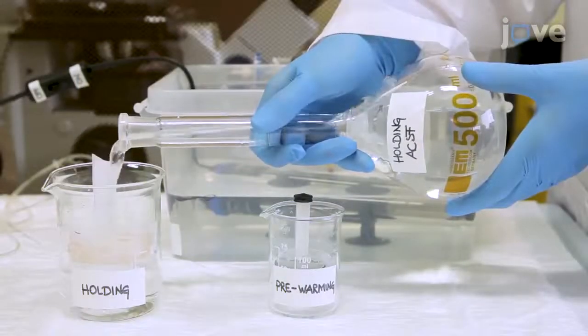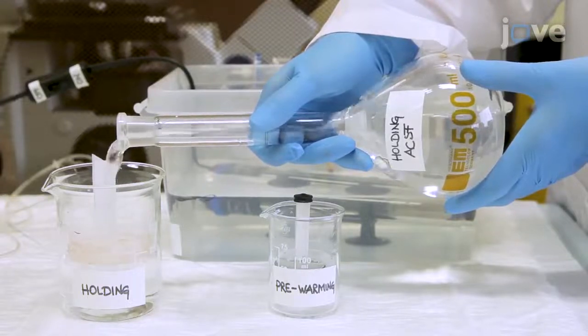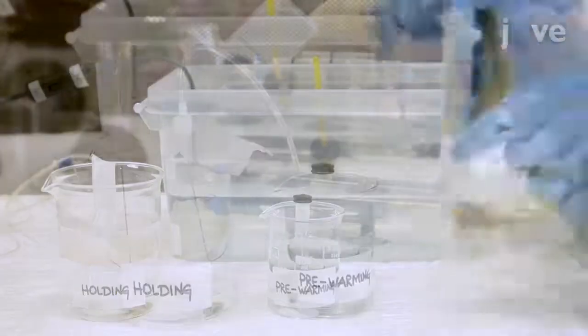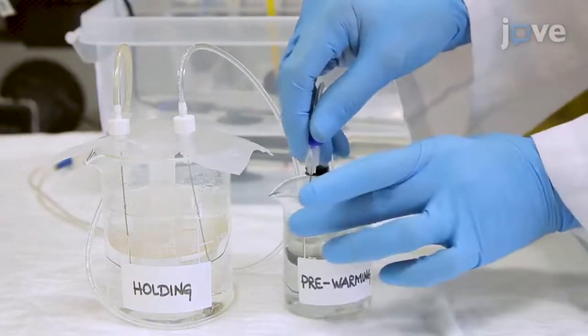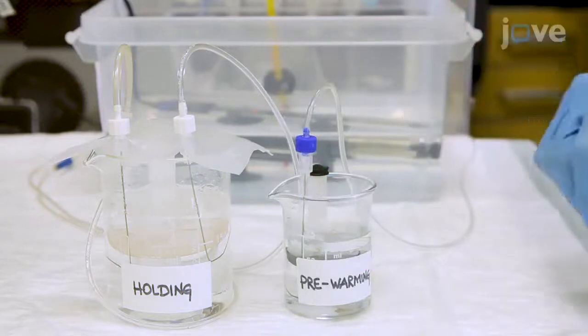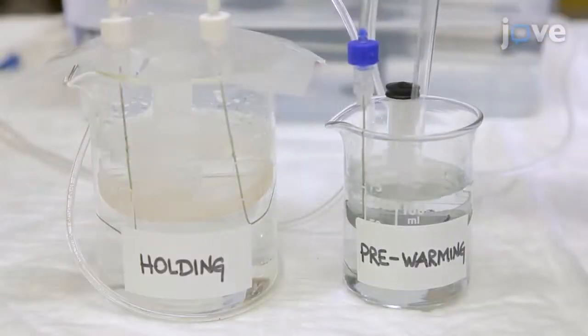Next, pour the holding ACSF into the holding and pre-warming chambers. Bubble the solutions with 95% oxygen and 5% carbon dioxide mixture, and remove any trapped bubbles using an inverted Pasteur pipette.